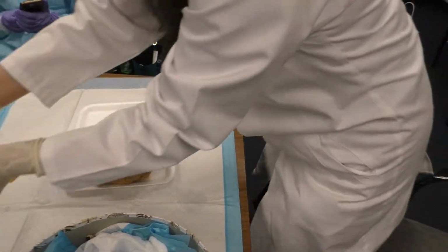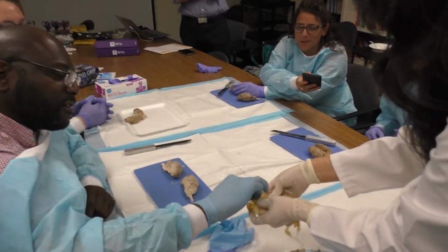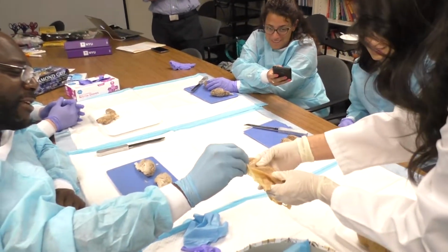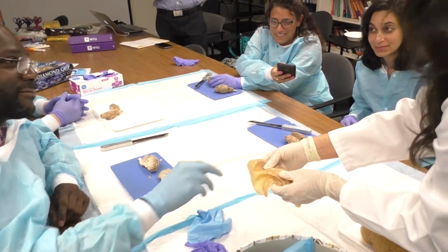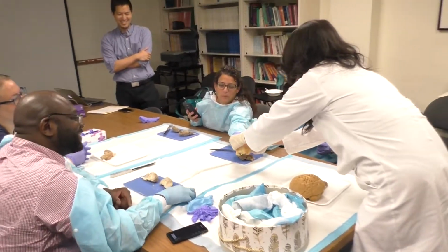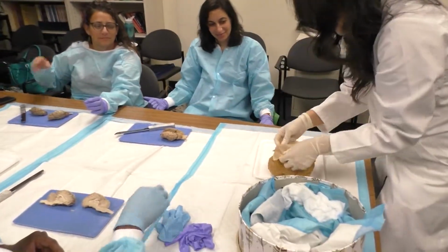Oh, you mean like parafilm? Much stronger than that. Let's see how far it can be torn. It's gonna be hard because you know what? This is a tough mother. That's right. Ha ha ha. Bad joke. Okay, dura mater means tough mother.